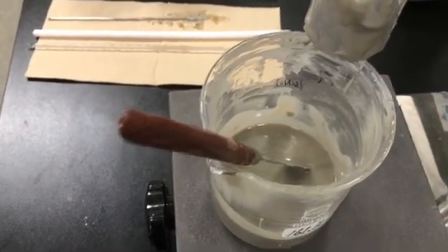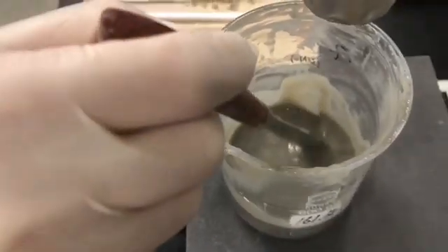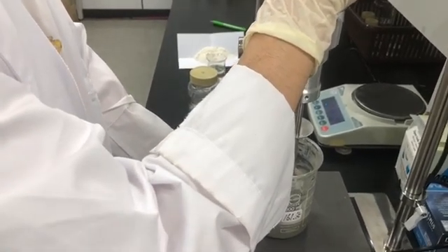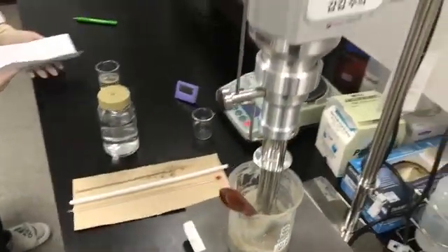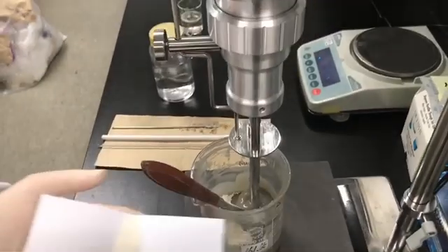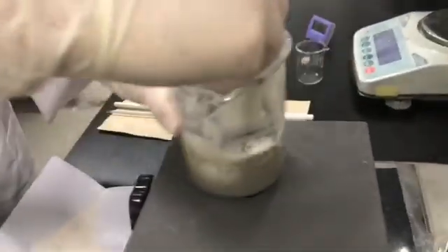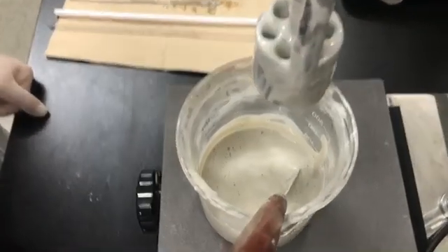Once FES-B is mixed well, the shape looks like this. Then add FES-C into the beaker, adding C in several additions and mixing at 2,000 rpm for 5 minutes. After adding C, the result looks like this.